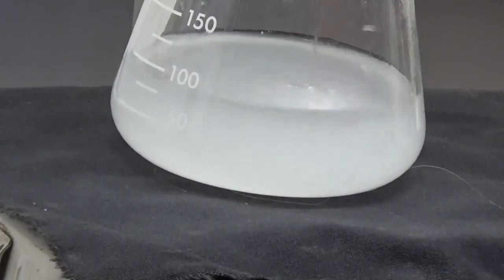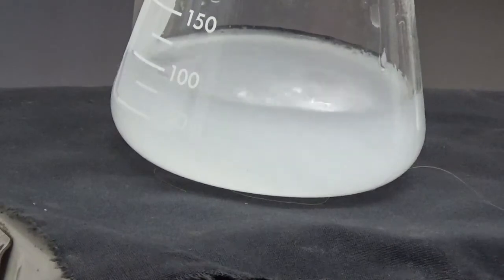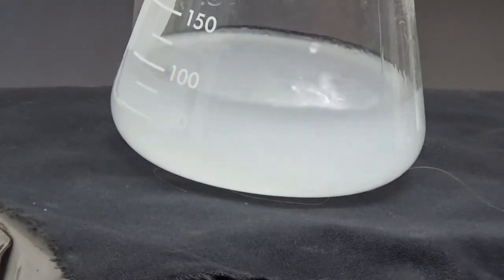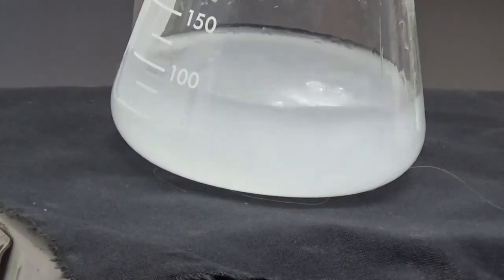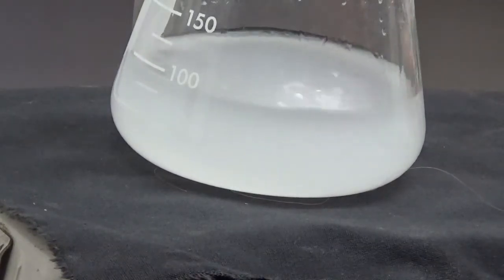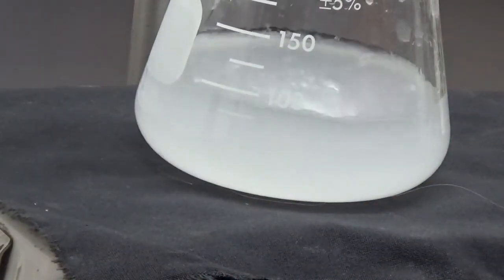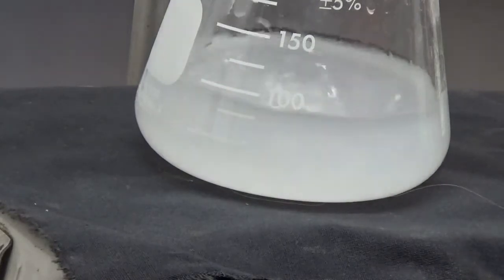Bubbles kind of go away. It gets cloudy. Very interesting. Right, there's 10 more mils of water. I'm very close to the edge. All right, now I'm going to start adding acetic acid again.